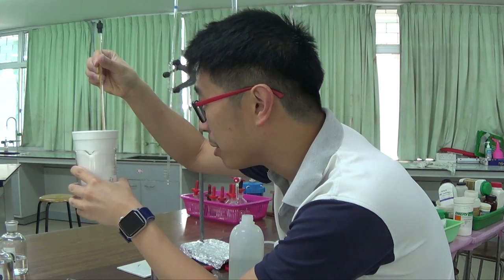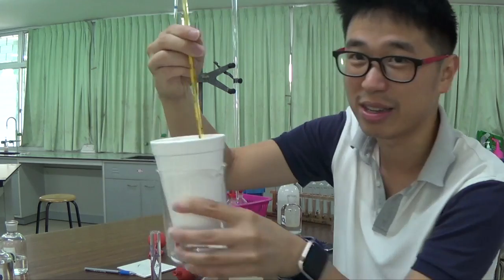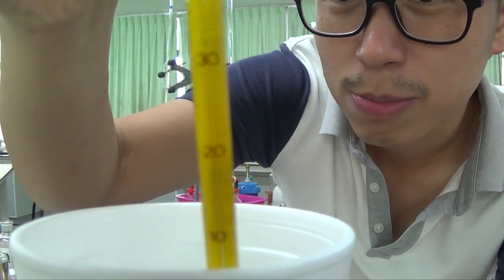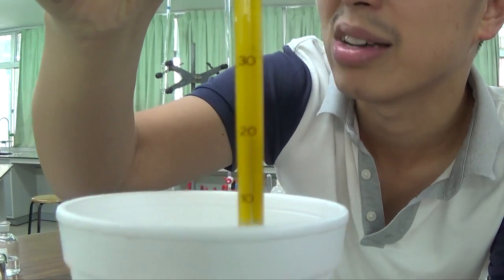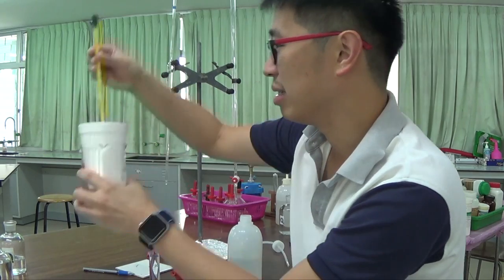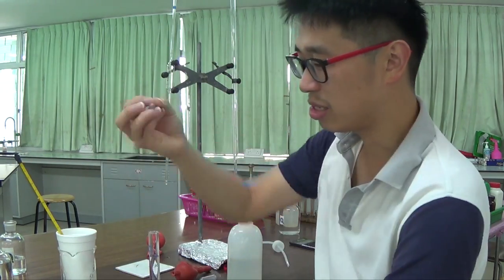In fact, the temperature of the solution has dropped further. It is now 21.0 °C. So some time has passed since I'm in this room. So do not assume that the temperature always stays the same.